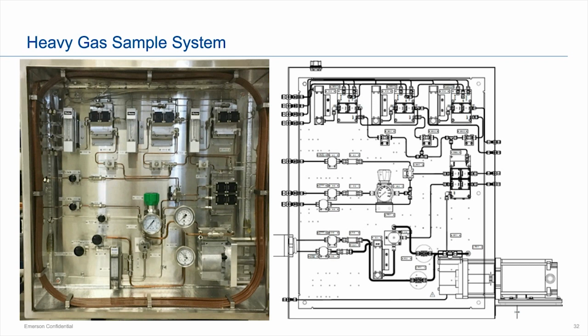Because we do have a grab sample option as well, you see a pressure regulator that you would make adjustments to. The addendum that I attached as one of the resources talks about how you would purge that regulator to ensure that you got all the air and any contaminant out of the system before it went on to the GC.